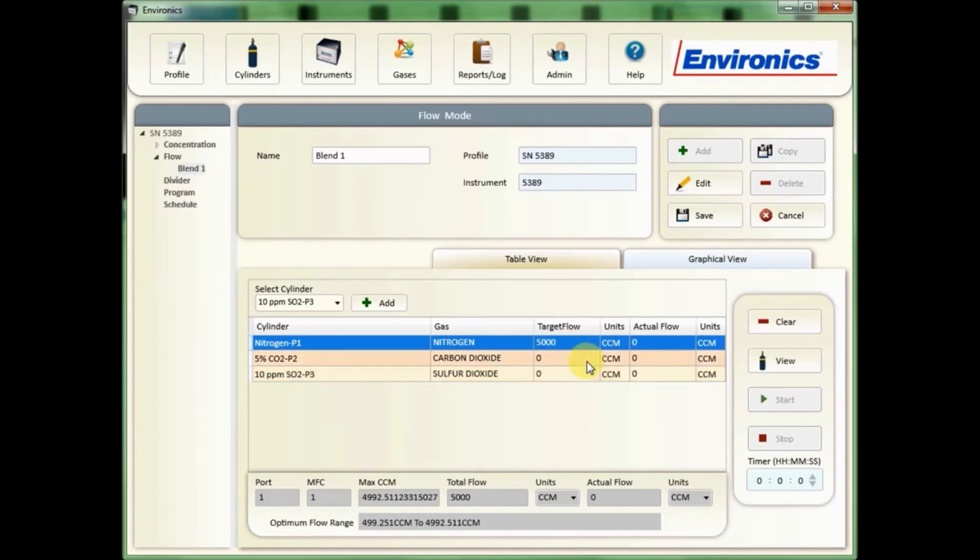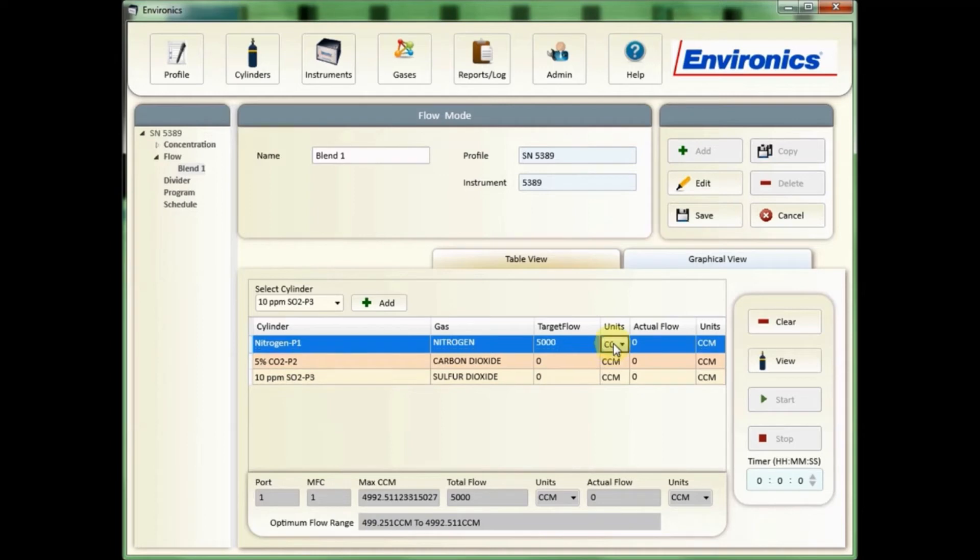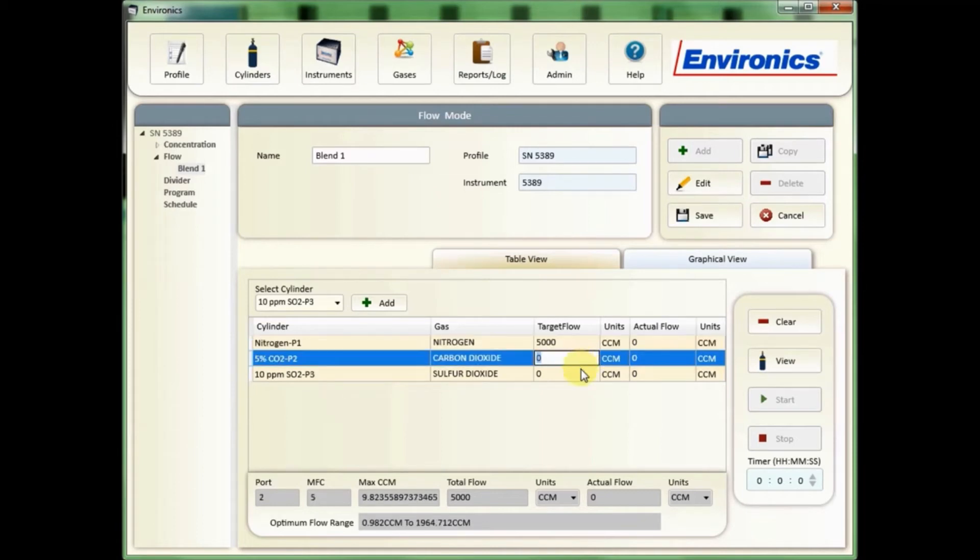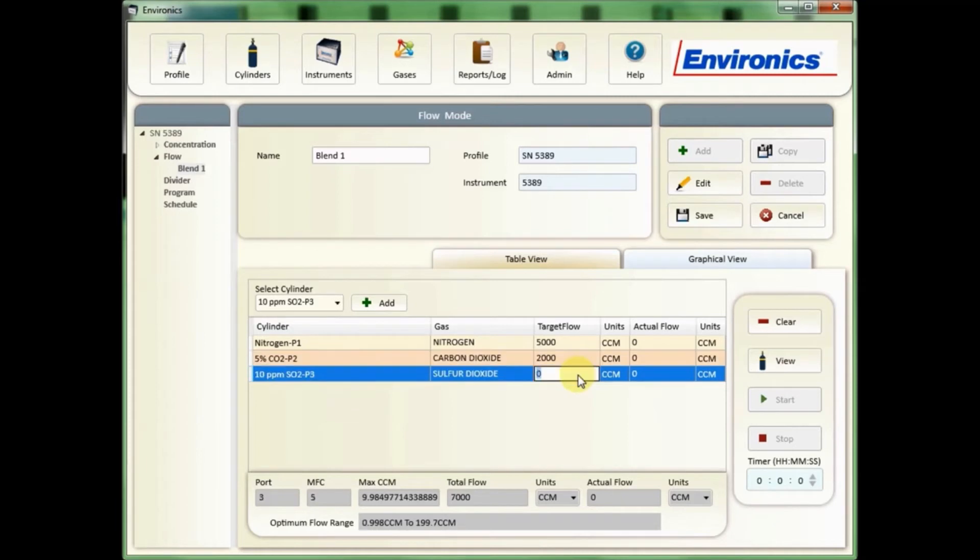If you wanted to change it to liters, you can actually double click on the units and change it from cc's to liters if you desire. The second flow controller I'm going to say we'll do that at two liters, and my third, my SO2, will do at 200 cc's.